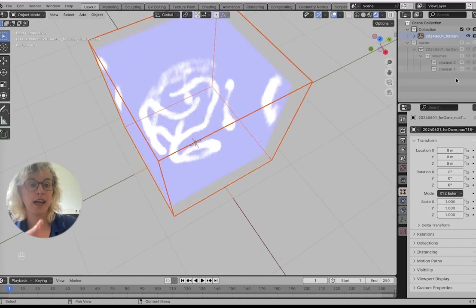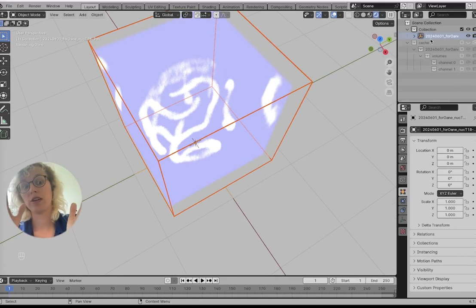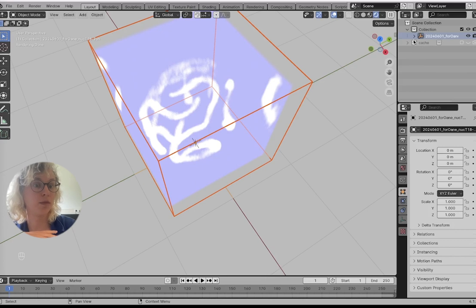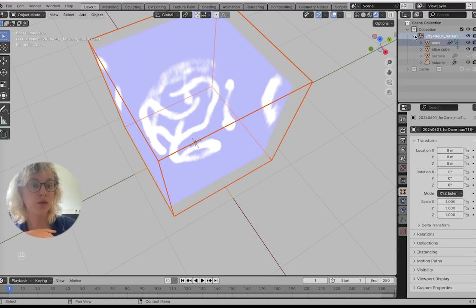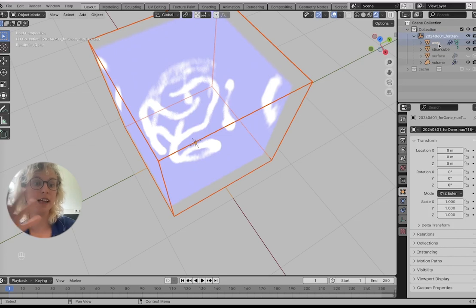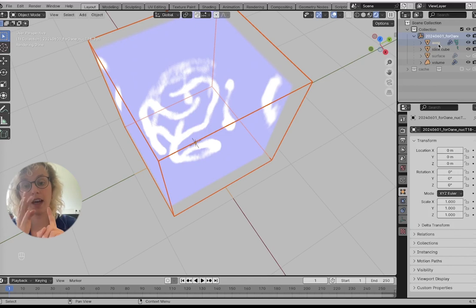If we look back at this outliner window where we actually see all of our objects, we see there's a cache with some data that we can click away. There is also, with the name of our file, an object which contains the axes, the slicing cube, the surfaces, and the volumes.